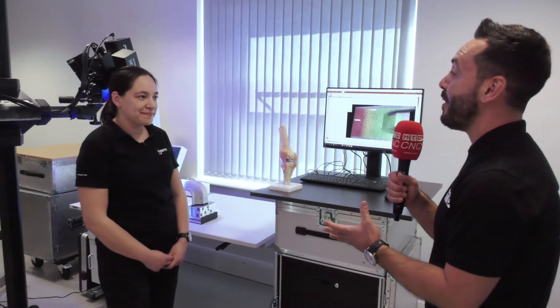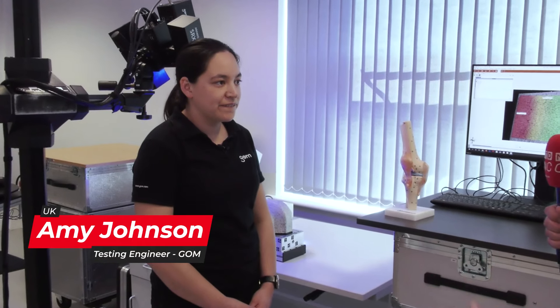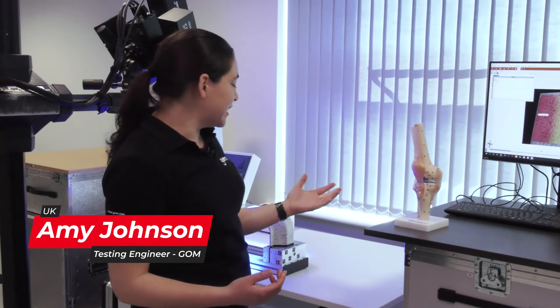MTDCNC have traveled to GOM HQ in Coventry to find out about the GOM testing technology. Amy, thank you very much for opening your doors to MTDCNC. We want to find out a little bit more about this technology — can you explain to our audience how it works?